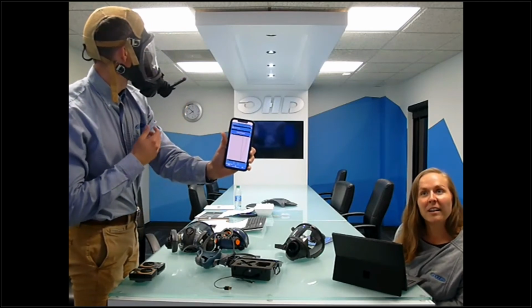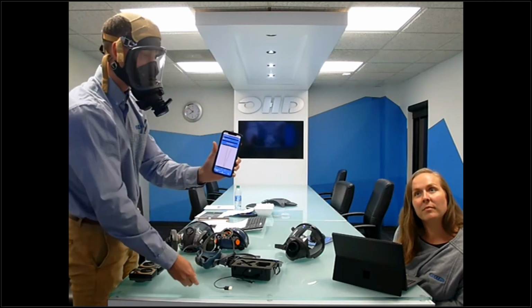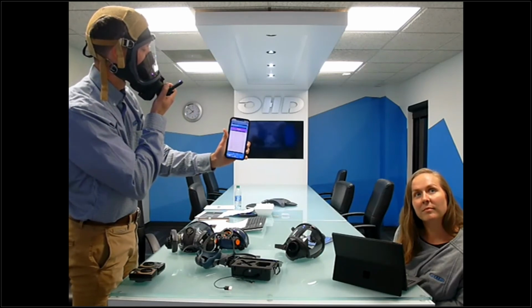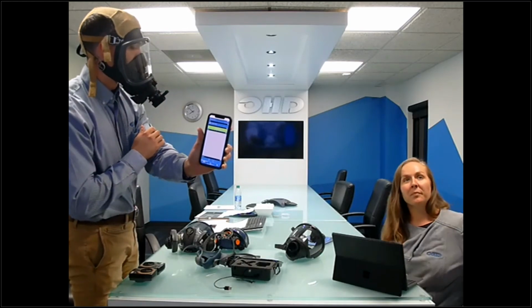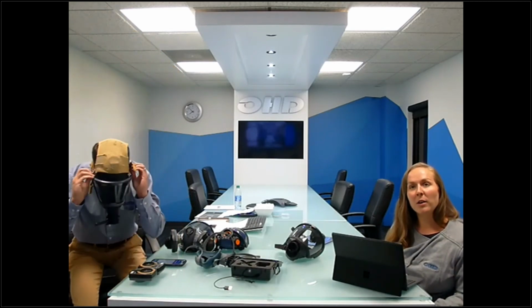So he's getting the fail there. So I'm going to remove it. There you go, pass again. So you can see it's just a really quick, easy way to evaluate that seal and your mask integrity. Get that visual representation. Feel good about your fit?